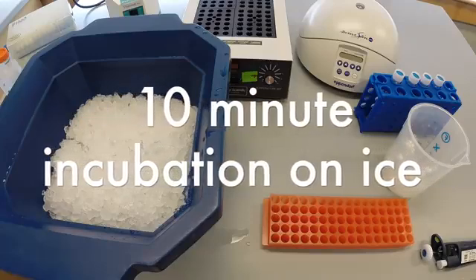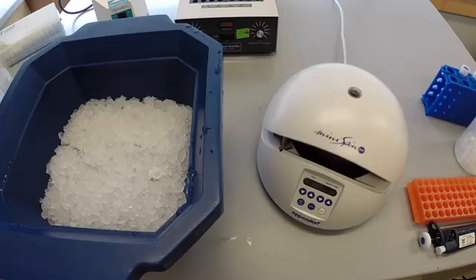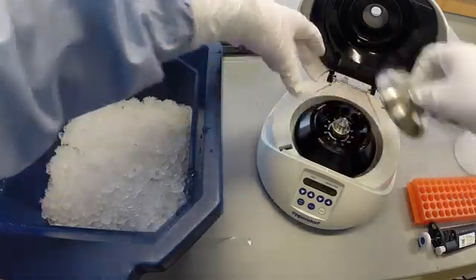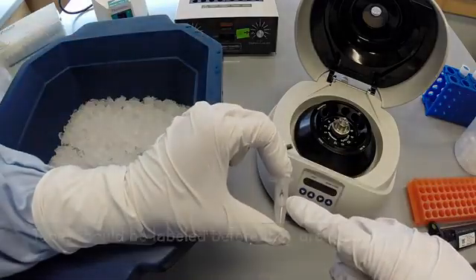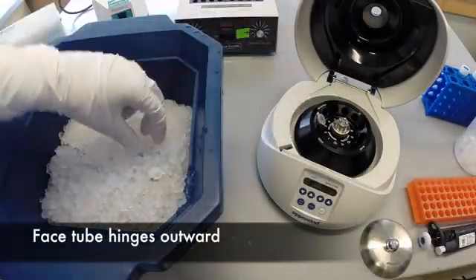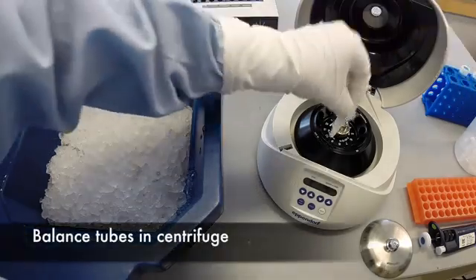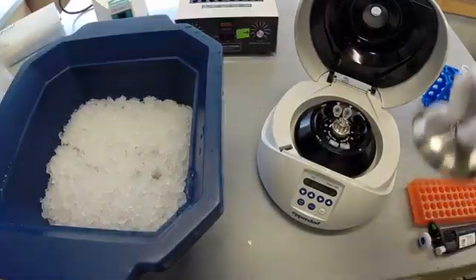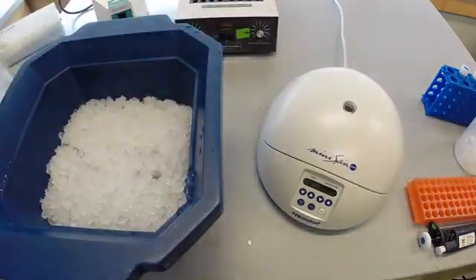Impurities in the solution will be removed by centrifugation. After flipping the switch in the back of the microcentrifuge, press the open button. Remove the metal lid inside by pulling on the knob. Make sure that the tubes are labeled either with letters or numbers before loading them into the centrifuge. Load samples with hinges facing outward, and balance the tubes across the rotor by ensuring that all tubes have equal volumes. Replace the metal lid and press it until it clicks securely onto the rotor. Close the lid to the microcentrifuge gently.